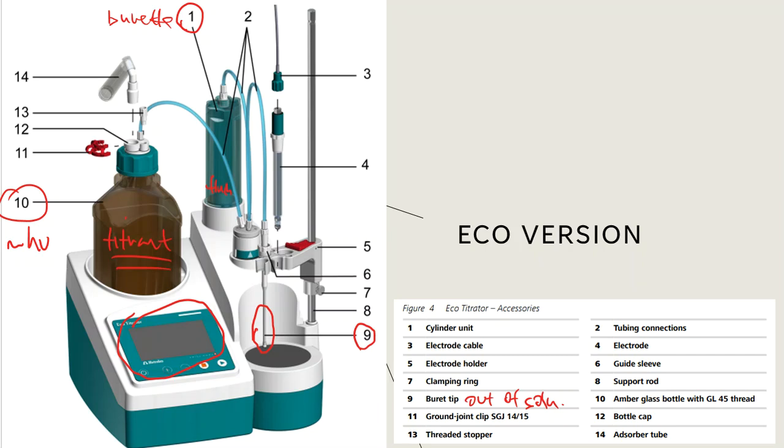If it's an acid, if it's a base, it is perfectly fine to do those in clear jugs. I mean, you've got clear burettes most of the time that you use when you manually titrate, so why can't we put this stuff in clear jugs? And we can, it's just that amber comes with the systems, and that's what you'll see most often when we begin to titrate these solutions, all right?